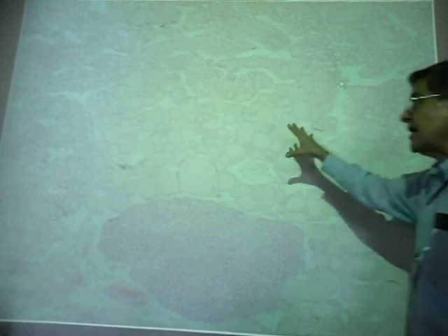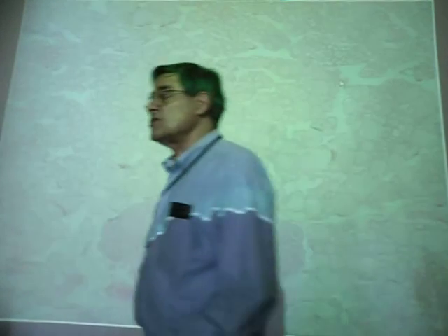We're going to start with the thyroid gland. What you're looking at here is the thyroid. Now, the thyroid is very distinguishable, but again, most of the slides will be labels exposed, so you know exactly what gland you're looking at. But I'm not going to ask what's the gland. I'm going to say, what are these cells? Or what are these tissues? And what do they produce? Thyroid is very distinctive because it's full of what are called follicles, thyroid follicles. That's what you're looking at here.